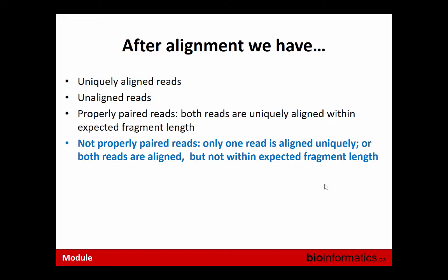But if there is one mismatch in one location and two mismatches in another location, it will still report us one mismatch, the best, absolutely best alignment. But maybe the true location is with two mismatches. We don't know this. Maybe the data, especially if we work with data like mouse, and it is very polymorphic data, so it can be all kind of things.